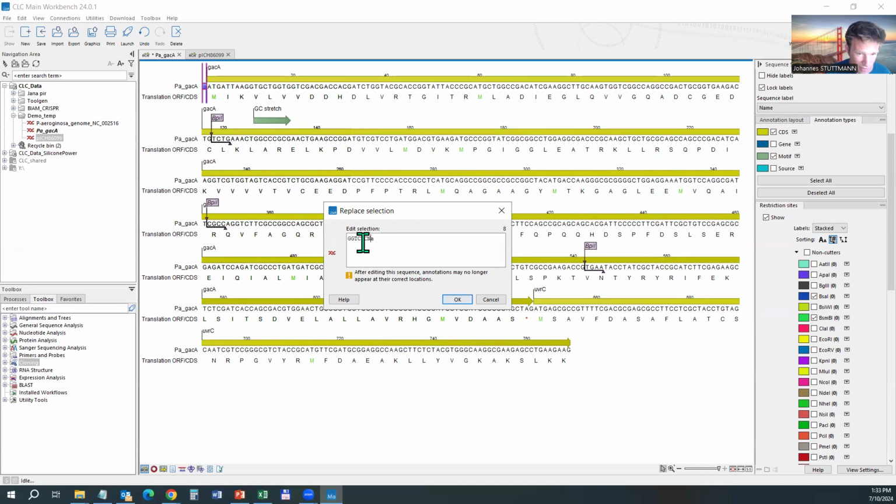And then we have an N, and then it will cut an ATG as a 4-base pair sticky end overhang. An N for the software doesn't make any difference, but it's not good for primer ordering. It will be more expensive. So let's just put an A. Can be any type of nucleotide, but I put an A in this position.